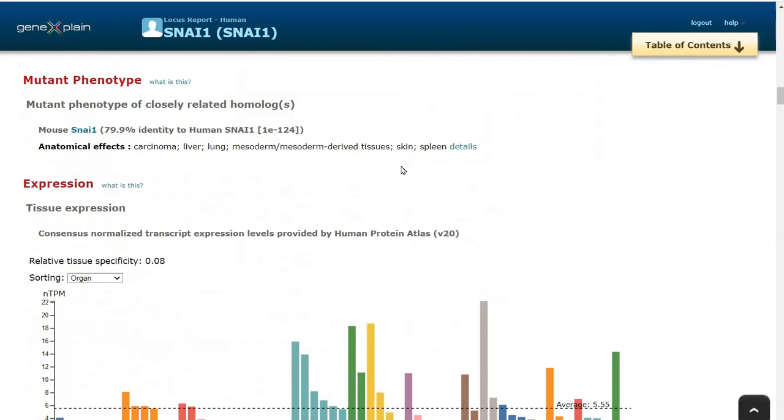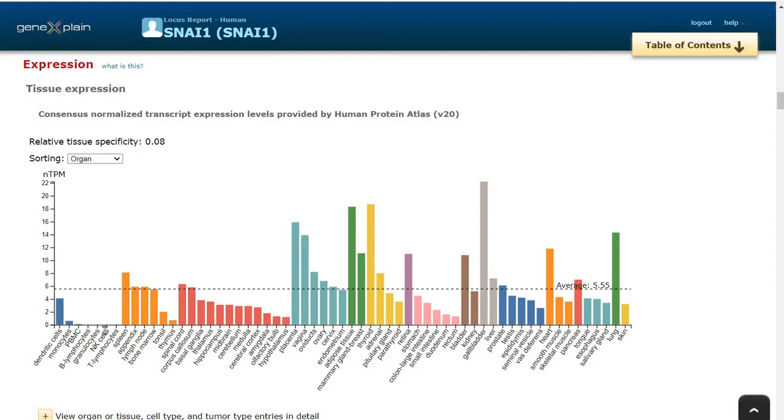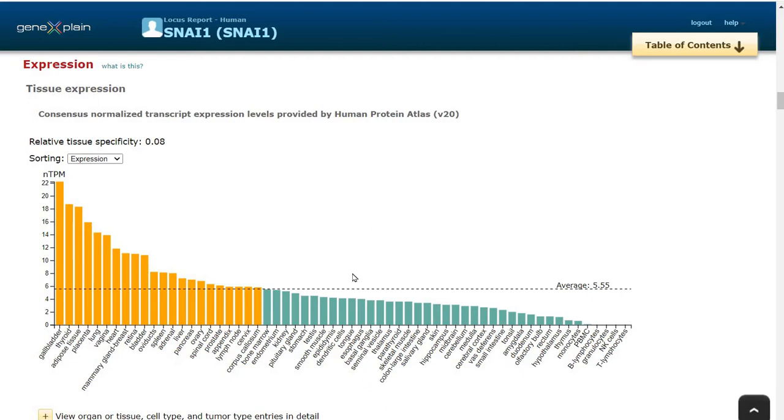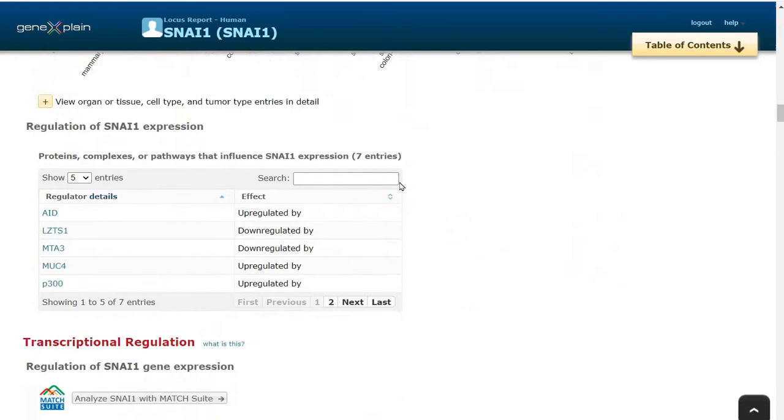For information about this gene, let's have a look at the expression features. It is shown that Snail 1 gene is expressed in several tissues. We can sort this table by expression values and see that it is highly expressed in gallbladder, thyroid, adipose tissue, and placenta. We can see that this gene is expressed below the average level in colon large intestine in normal conditions.